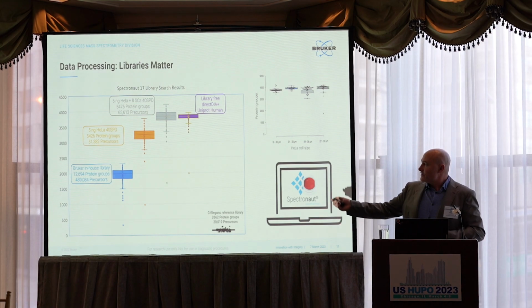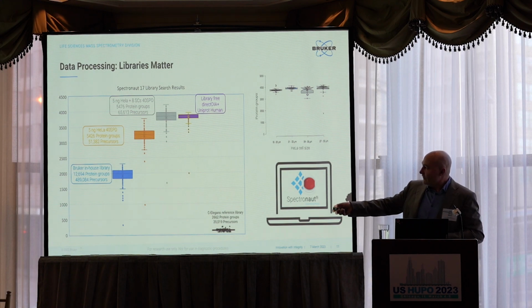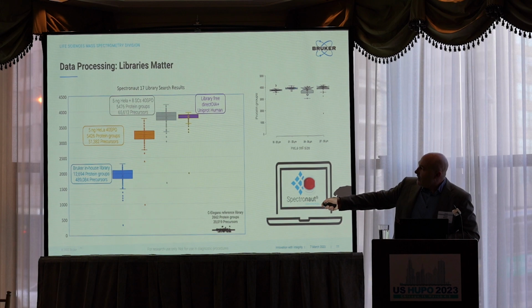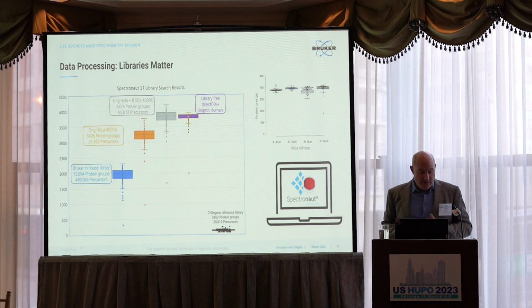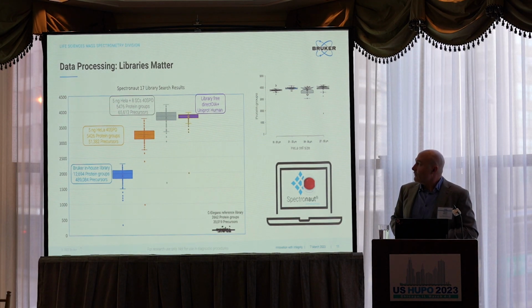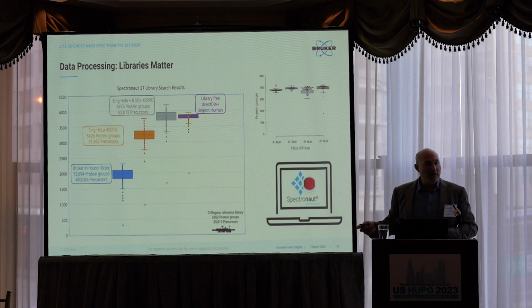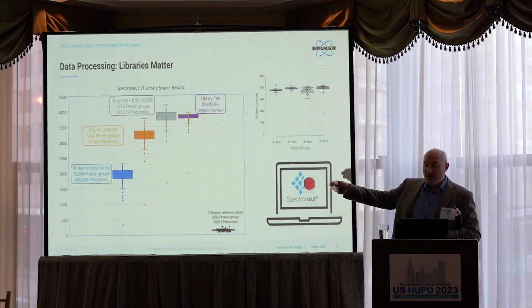And then, of course, you can search all of your data against that library, which we did, and you can see the performance there. You can also create a project-specific library, which is what was done here, using 5 nanograms of HeLa. In that, the number of protein groups is modest, about 5,400, and the number of precursors is also quite modest. But we do increase the number of proteins that we identify. And then you can modify that library further by adding 8 single-cell samples that were run. So altogether, this is what these different libraries look like.